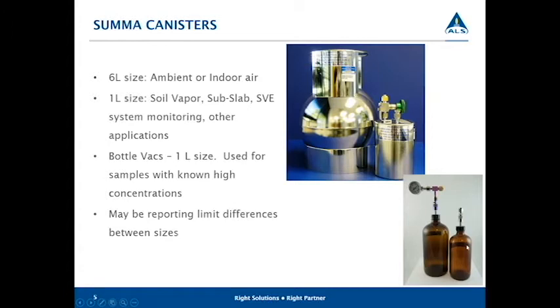These down here, I'm not sure how familiar the group is with these, but these are bottle vacs, and these are like a 1 liter amber glass bottle, exactly like you would use for sampling SVOC water. And these are used for samples with known high concentrations.